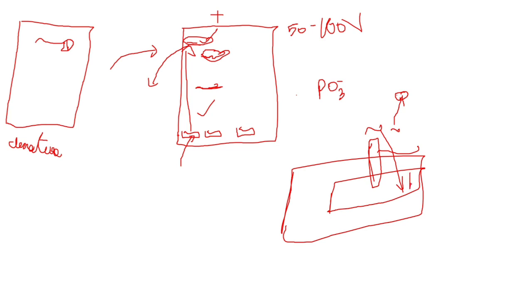Next, once the RNA is transferred to the nitrocellulose membrane, we will add a probe RNA. A probe is nothing but a known sequence. Since the probe RNA is complementary to this RNA in most of its portion, it will hybridize with our RNA.